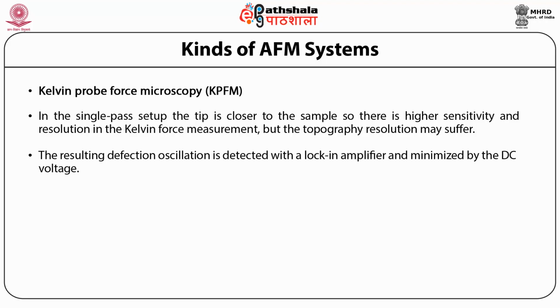Applications of KPFM include imaging the Kelvin potential or work function of a surface and measuring applied voltage differences between conductors.